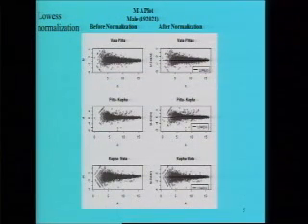It's a two-channel microarray data, so the first step was to take care of this dye bias. So we plotted these MA plots. The left panel shows the MA plots before normalization. If we look at this left panel, the first MA plot corresponds to Vata and Pitta Prakruti.